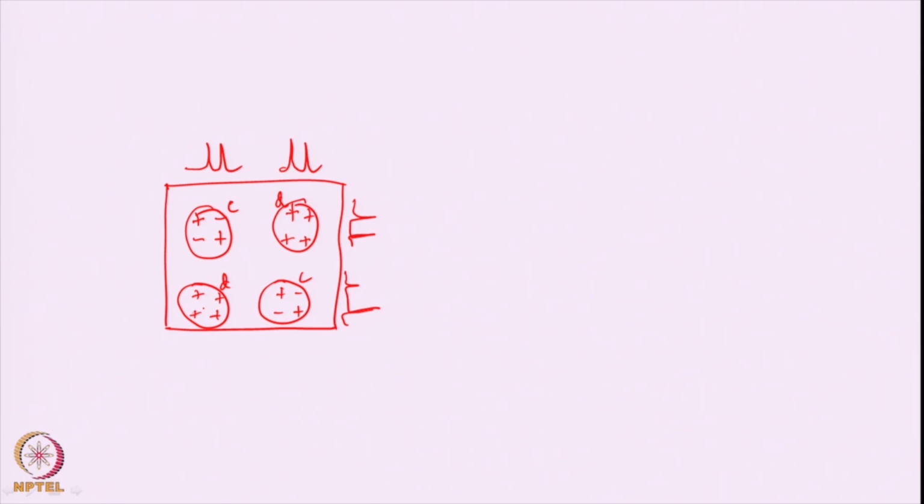We also calculated the spectra for 3 spins, different kinds of 3 spins. In every case the same situation appears. The diagonal will have dispersive line shapes with the fine structure of the individual spins, and the cross peaks will have this plus minus minus plus character with absorptive line shapes. Now, the diagonal having the dispersive line shape is a disadvantage here, and therefore to circumvent this problem a new idea emerged, and that is what we are going to discuss today.